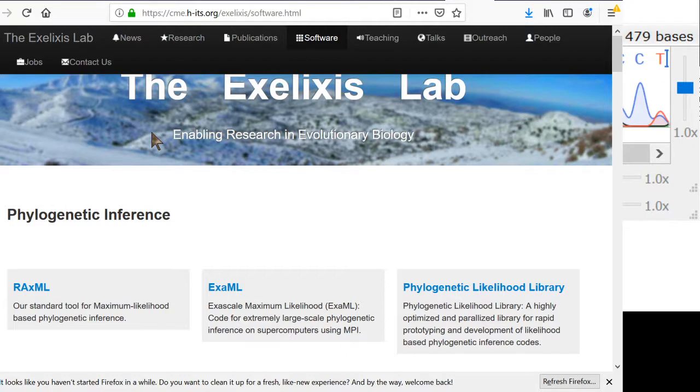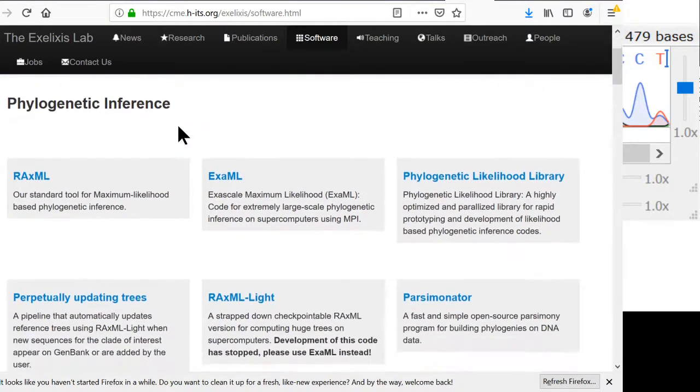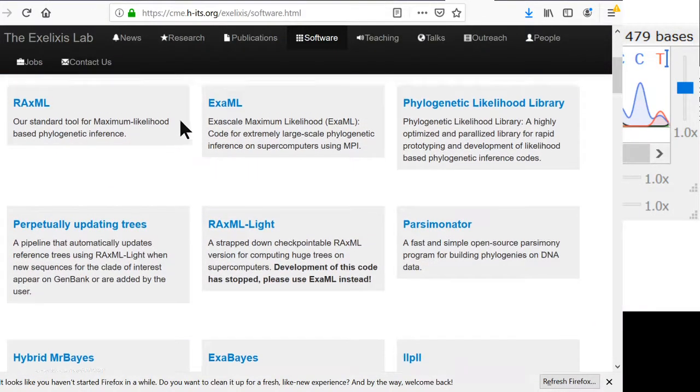Like with RAxML, you might start your calculation, and if you have a lot of sequences in there, you come back in the morning to get your results. But it does a very good job, and it's one of the most trustworthy ways to make trees. And then it calculates the bootstrap value, and what it means is that it generates a tree 1,000 different ways, and then it scores how good that tree is. And so out of those 1,000 different trees, it figures out which one was the best, and that's how it calculates the bootstrap value, so you know how much you can trust the different branches. So if you really want to make a good tree, you can use RAxML.